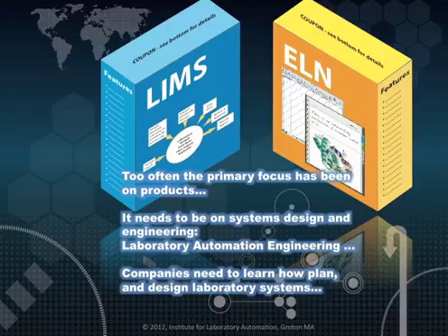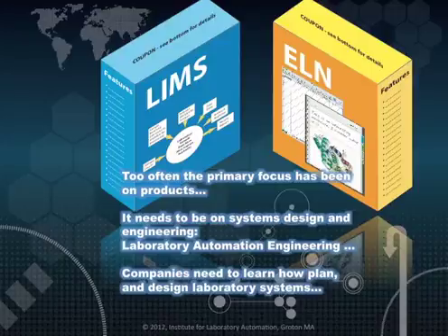When people are dealing with laboratory informatics products, the focus has too often been on the products themselves. Emphasis needs to be put on overall systems design and engineering. Companies need to learn how to plan and design laboratory systems, taking into account the effects of one system on another, and approach the development of laboratory information technology in the same way they would plan for manufacturing systems.